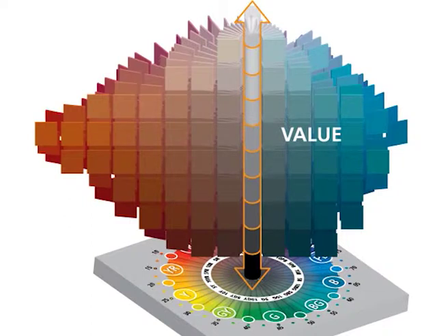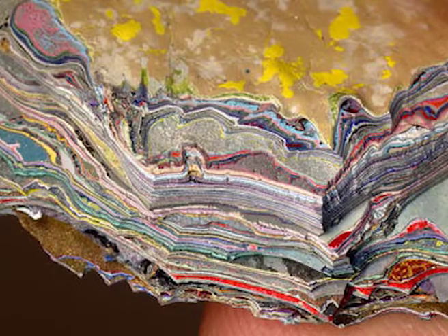The number, sequence and thickness of layers, and the sequence of colors of the different layers present, are observed and noted with the help of a microscope, a combination of stereo, transmitted light and a polarized light microscope. This is done at magnifications of 2x to 200x to examine the layers in paint. Now, many layers will be visible without preparing the sample, but definitive paint layer identification often requires some sample preparation techniques.